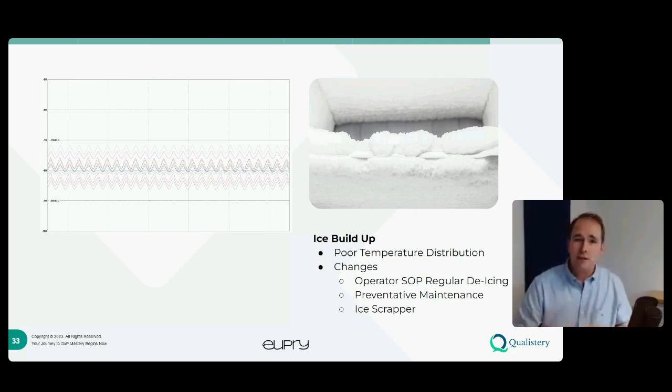But as far as alarm systems go, the regulations on that are very different. We need to think about how we are buffering that probe. Is that alarm probe within glycol or a metal buffer? If it is, we don't want any alarm delays at all. If it's not, we need to think about what the frequency of that alarm is. How often is it reading? Is it every minute, every 5 minutes? So we need to understand what the alarm delays are.